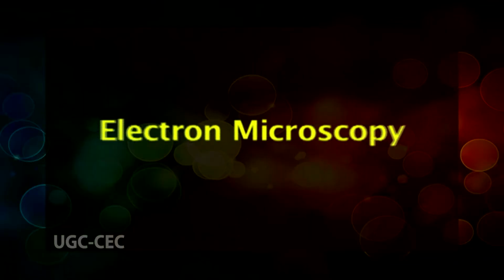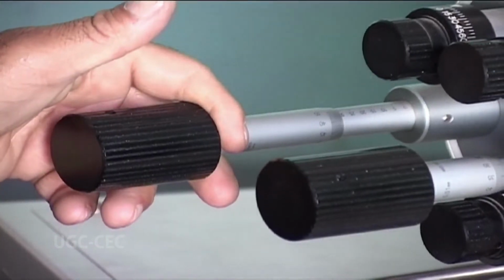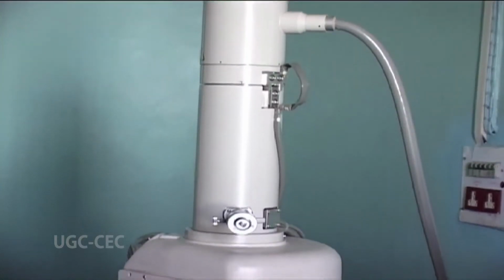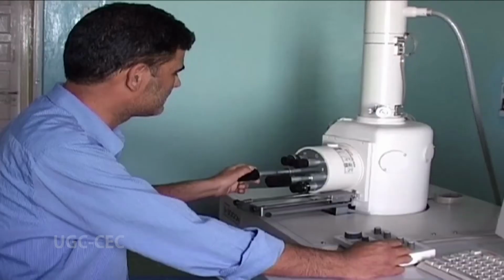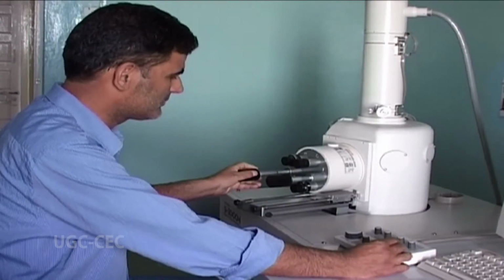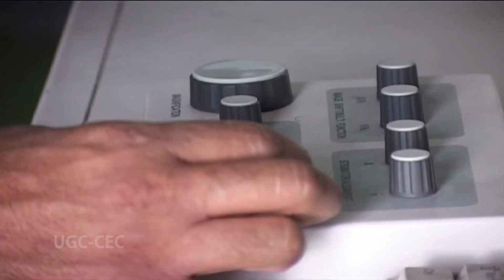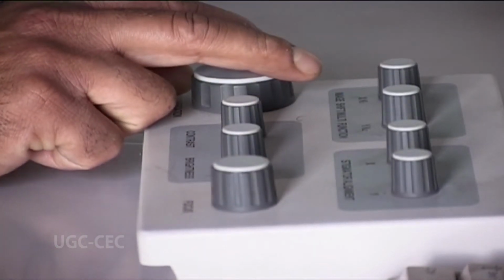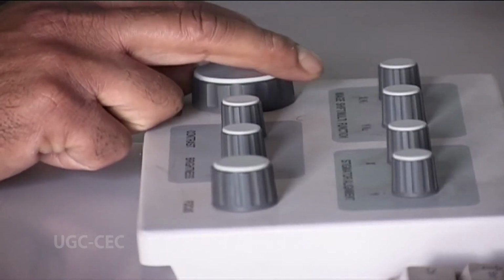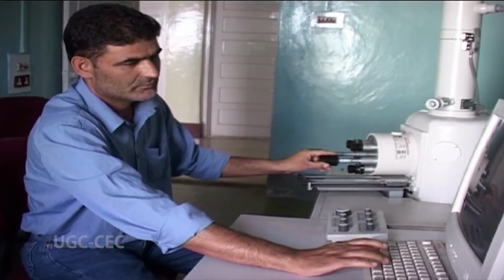Now, the third major type of microscopy is electron microscopy. This is a form of microscopy that uses electron beams to create an image of the object being used. They have a much higher magnification than light microscopes and so a much higher resolution as a result. This allows us to see smaller specimens in greater detail. The resolution is able to be increased because as the electrons travel faster, their wavelengths become shorter. So there is a direct correlation between reducing wavelength and increasing resolution.